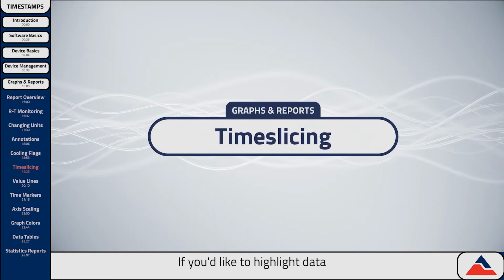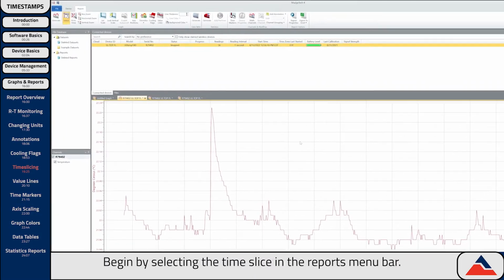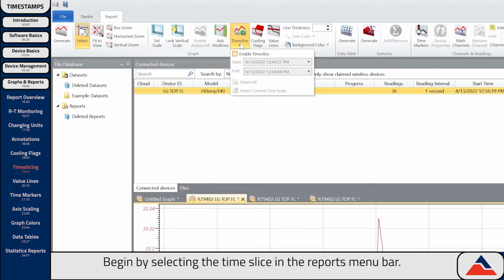If you'd like to highlight data based on only a portion of the graph, you can create what's called a time slice. Begin by selecting Time Slice in the Reports menu bar. This will bring a drop-down menu where you'll check the box labeled Enable Time Slice.